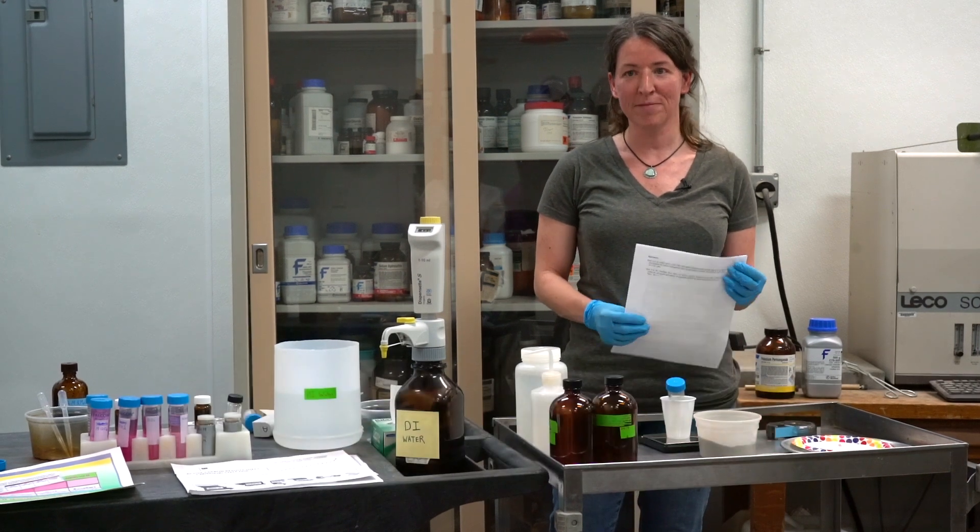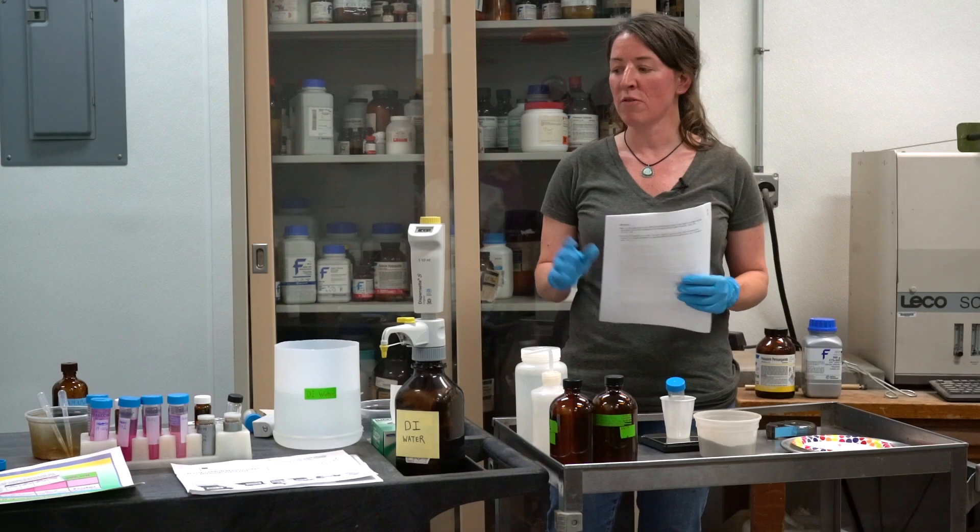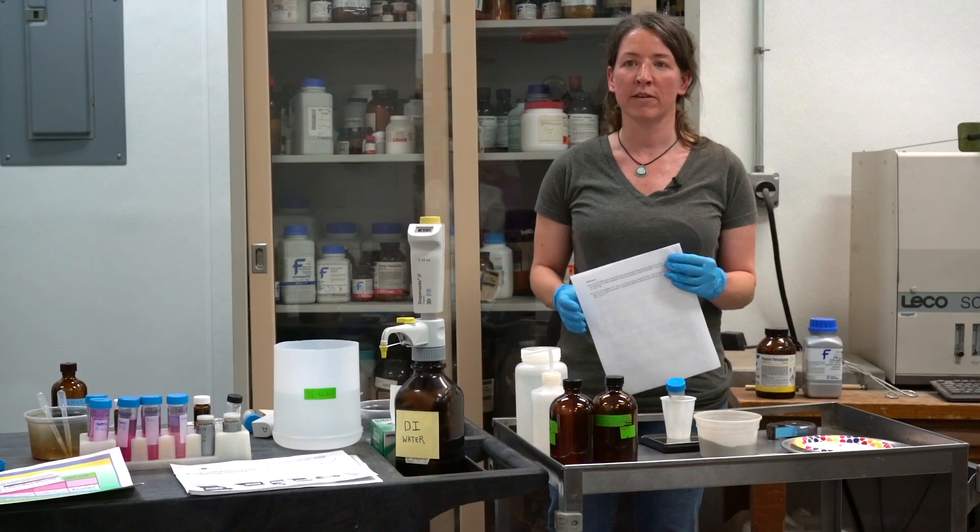My name is Amanda Wolfgier and I'm here at the University of Missouri Soil Health Assessment Center. I work here in the lab and I run the active carbon analysis here. Today we're going to do an active carbon demonstration.